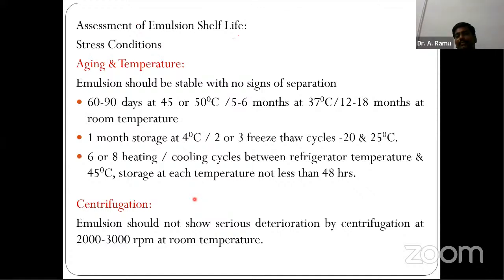Apart from this, the shelf life or stability of the emulsion can be assessed very quickly by accelerated stability analysis. In order to evaluate the stability of the emulsions very quickly, you expose the emulsion to stress conditions. What are the various stress conditions that the emulsion has to be exposed to? The emulsion has to be exposed to aging and temperature.